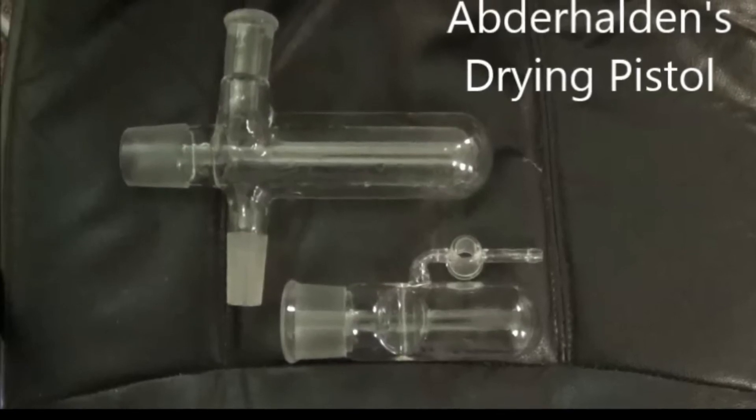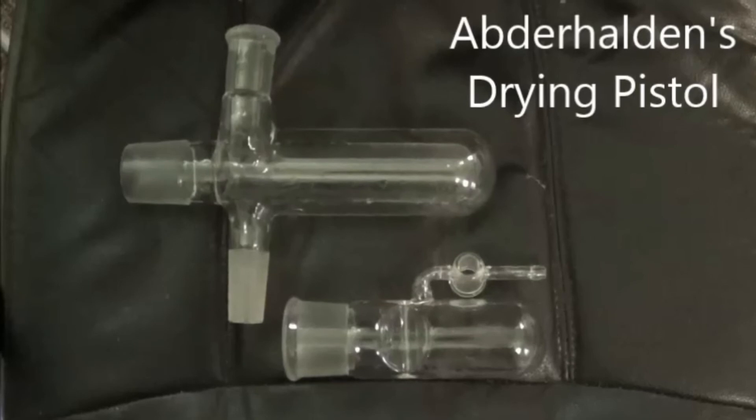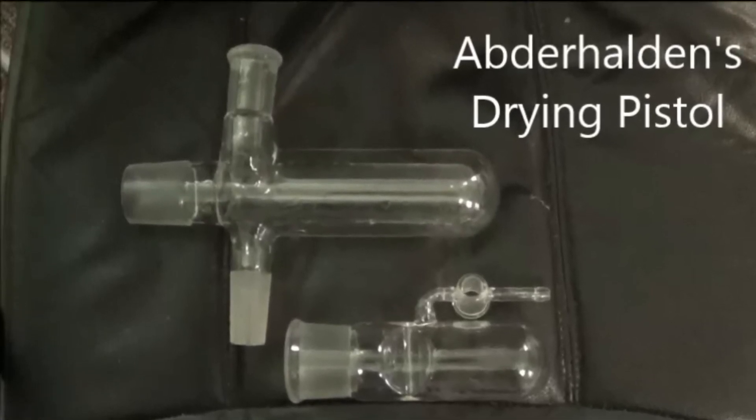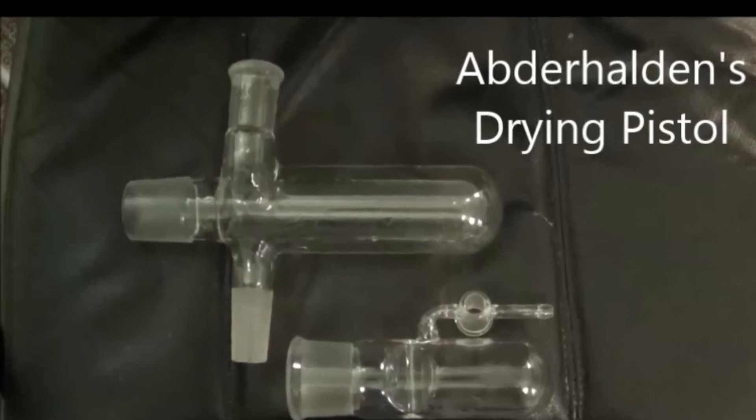This piece of glassware is an older alternative to vacuum drying ovens. Because the sample is heated, it can be dried much faster than in a vacuum desiccator at room temperature. Its drawback is that not as large samples can be placed into the drying chamber.